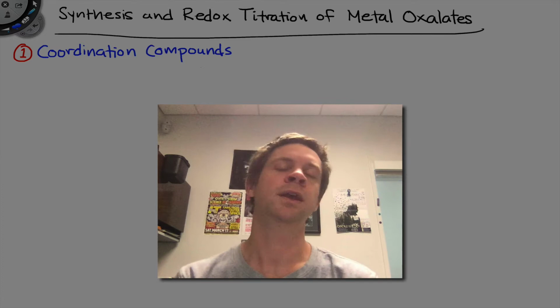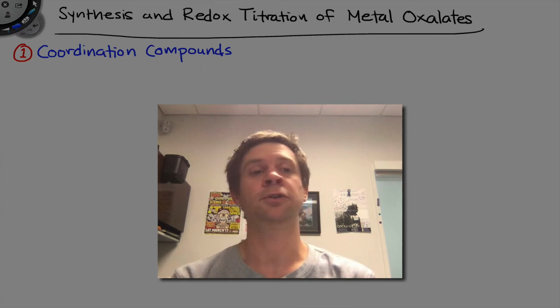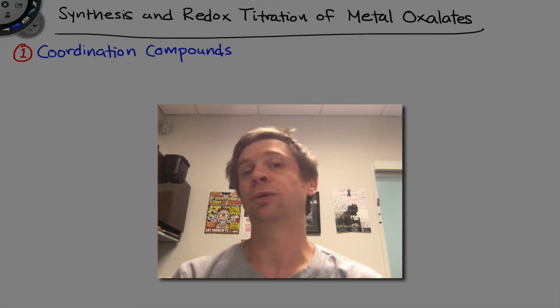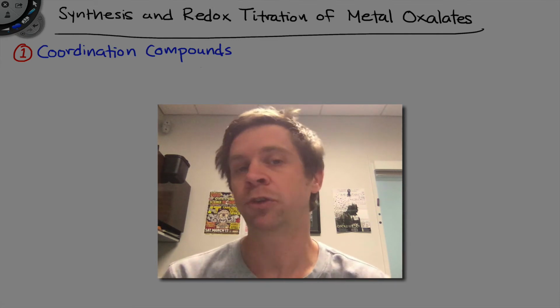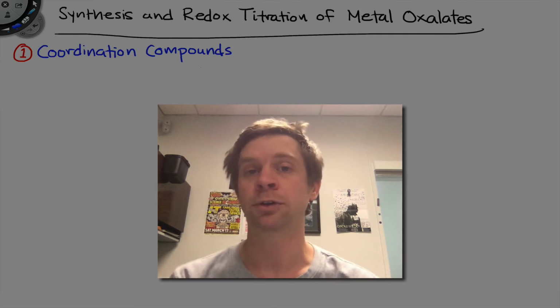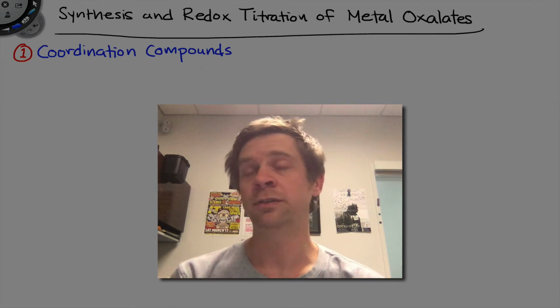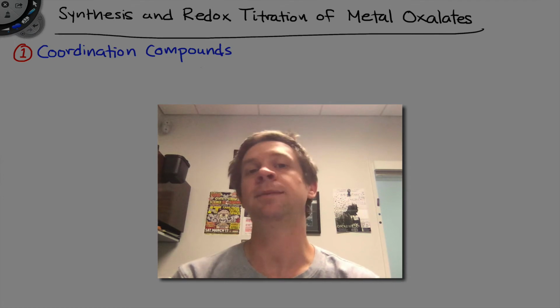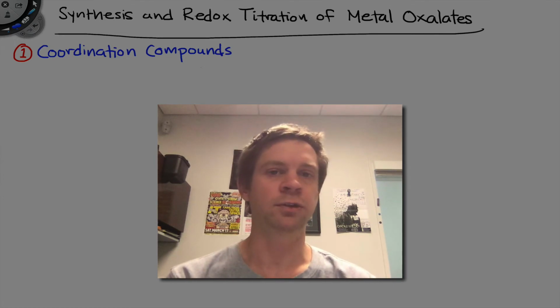So the goal here is to first make the compound, get a sense of the percent yield, and then assess its purity doing a redox titration with potassium permanganate. So in this video, we'll talk about the theoretical background of redox titration, which is similar operationally to acid-base titration, but distinct in the type of reaction upon which the titration is based.